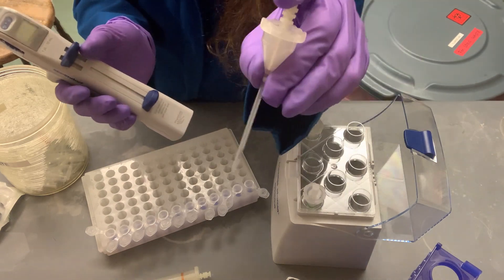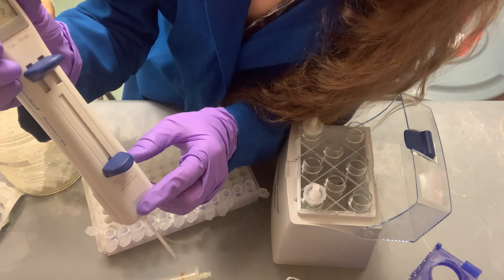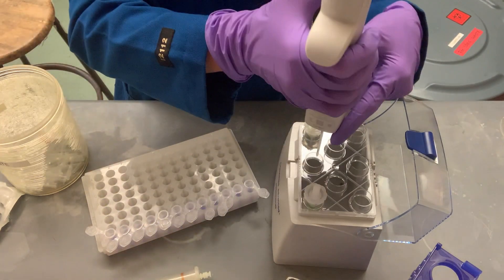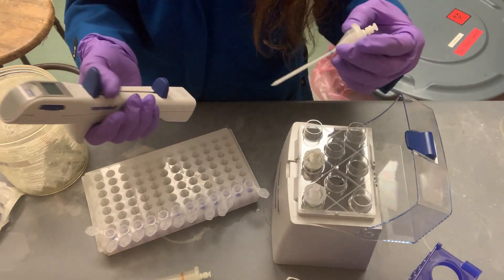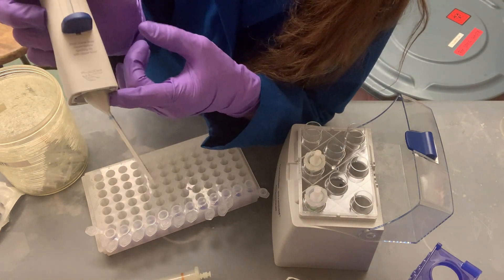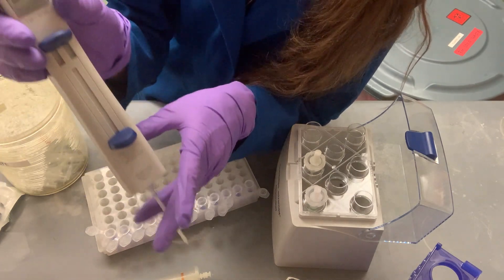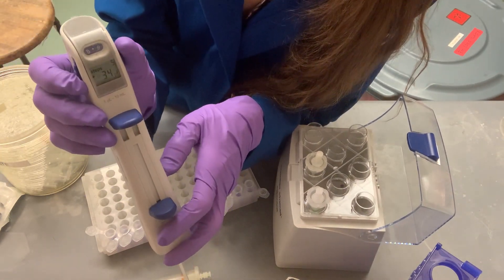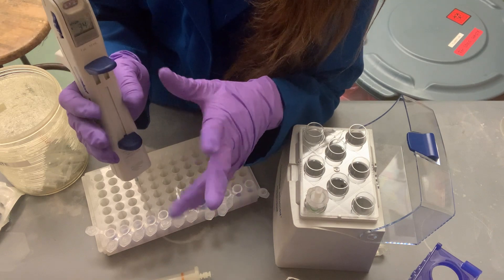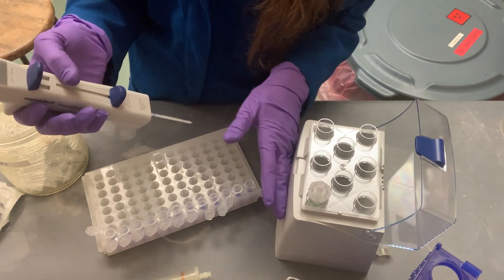The 100 µL tip allows step sizes of 1 µL. Make sure the tip goes in straight — if it's crooked it won't work; push it down until it's snapped in properly. The 200 µL tip moves in 2 µL step increments. So with the 100 µL tip you get 1 µL precision; with the 200 µL tip, only 2 µL increments. You might not be able to get exactly the volume you want.